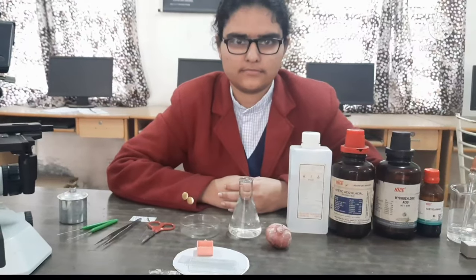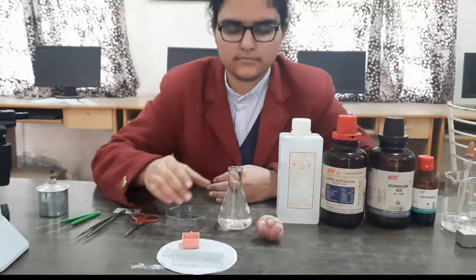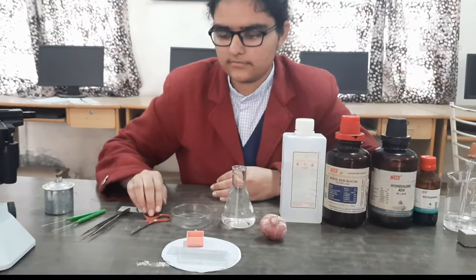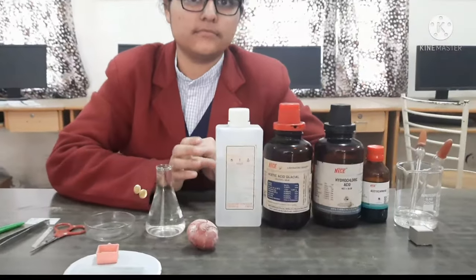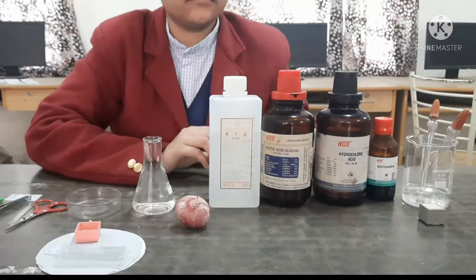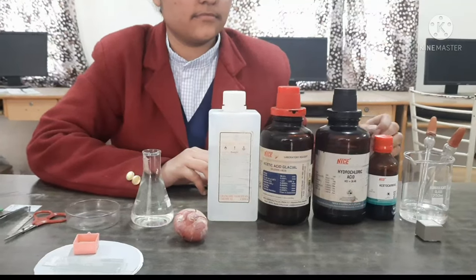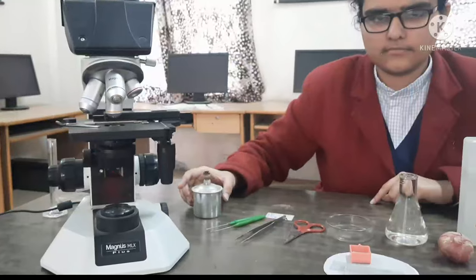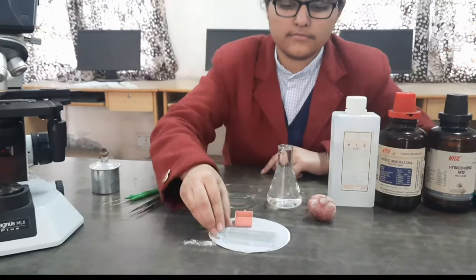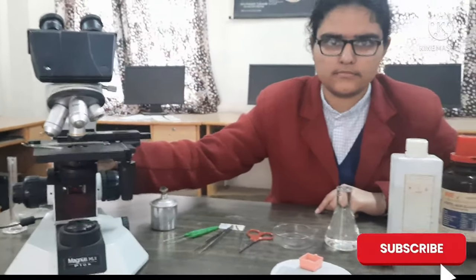Materials required for this experiment are: onion bulb, conical flask, Petri dish, scissors, forceps, needles, some solutions — ethyl alcohol, acetic acid, hydrochloric acid, acetocarmine stain, distilled water, droppers, spirit lamp, slides, cover slips, blotting paper, and compound microscope.